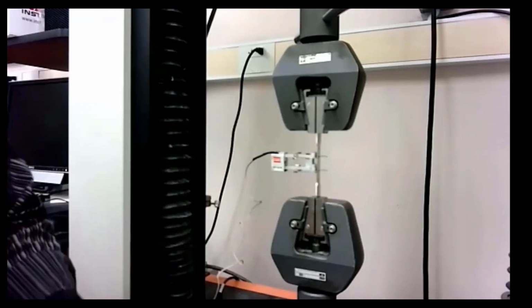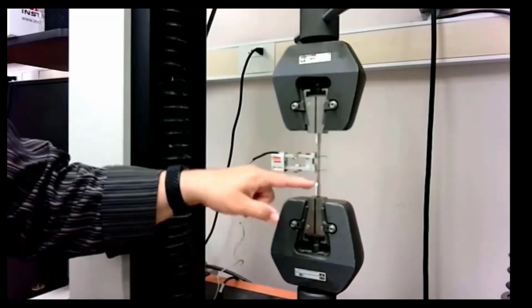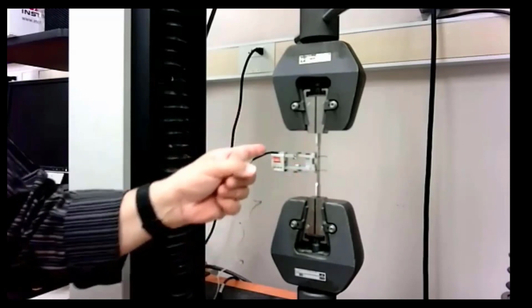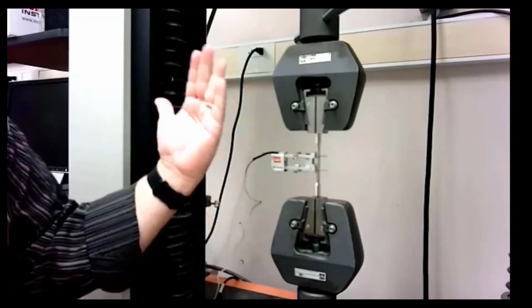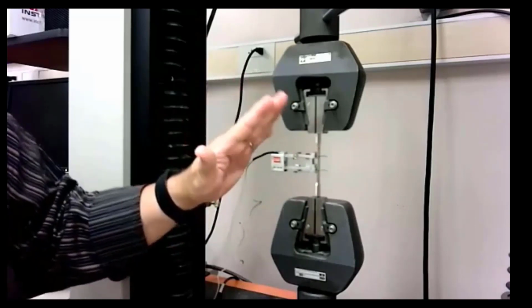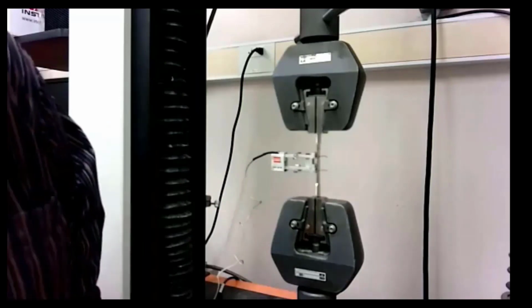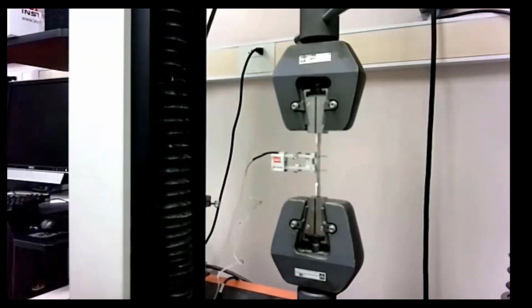Now I need to ensure that the extensometer is roughly centered vertically between my gauge lines, centered front to back across the width of the specimen, and that it's vertical, that it's not tilted one way or the other. So I can do the first just by looking at it, and visually I'm relatively close between the gauge lines, so I don't have to worry about that.